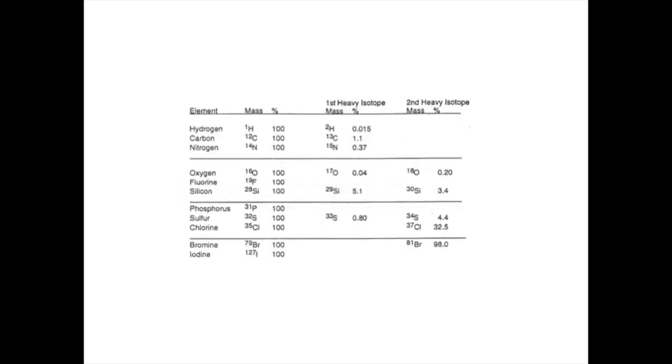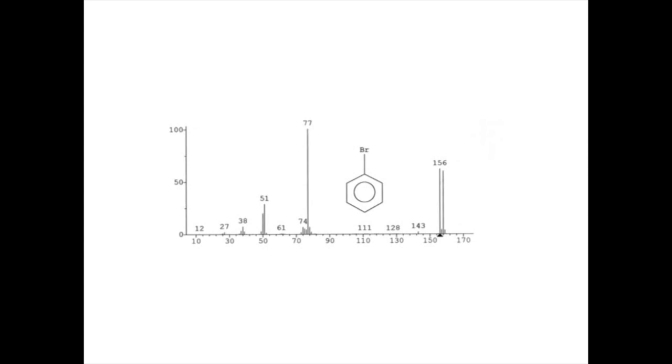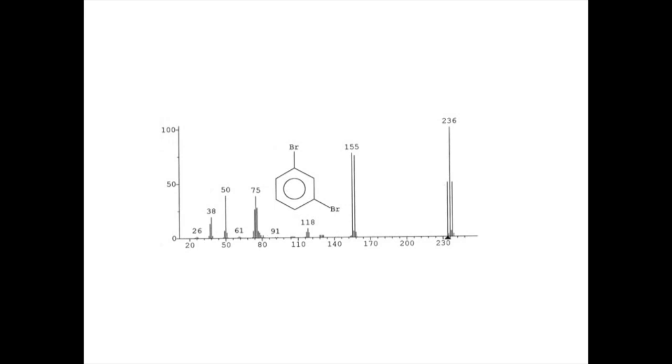Notice that bromine is also a special case. Its population is a nearly one-to-one mixture of isotopes with mass 79 and mass 81. This fact also leads to an unmistakable signature in the mass spectrum. Here we see the molecular ion at 156 units and a peak two units higher with almost the same intensity. With two bromine atoms in a molecule, the probability is greatest for the molecule to have one heavy atom and one light bromine atom. The pattern looks very much like a triplet in an NMR spectrum. The tall peak at 236 is actually the M plus two peak. Notice the doublet at 155 and 157. This is a strong clue that the fragment at 155 contains one bromine atom.